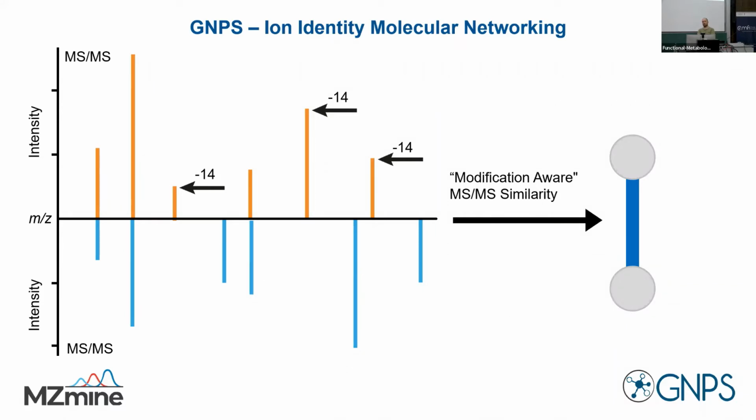Do you always have to go back and restart the entire job for that? Yes, kind of. Well, in Cytoscape you could also raise the threshold by removing edges. But we typically just rerun the jobs. I'm going to show you in a second, there's a very convenient function in GNPS to do that quickly. And also talking to Ming, who developed GNPS, he's like, just rerun it. It doesn't matter, we have the resources to do that. So he's also rerunning everything.